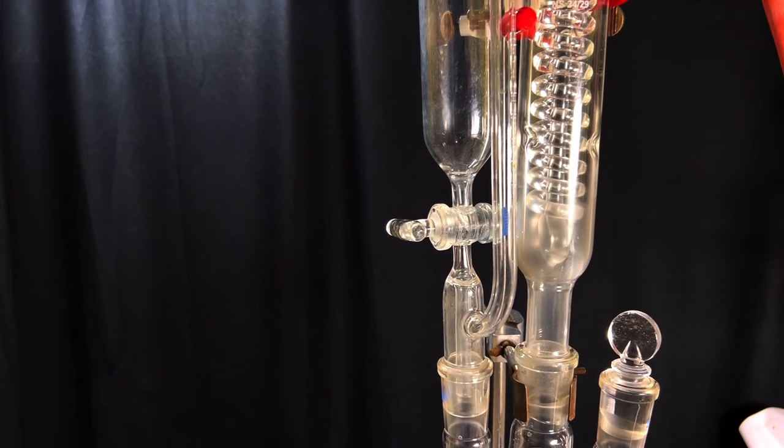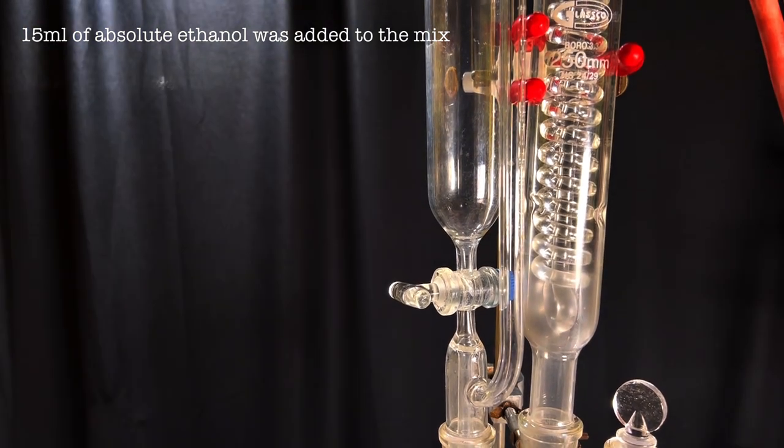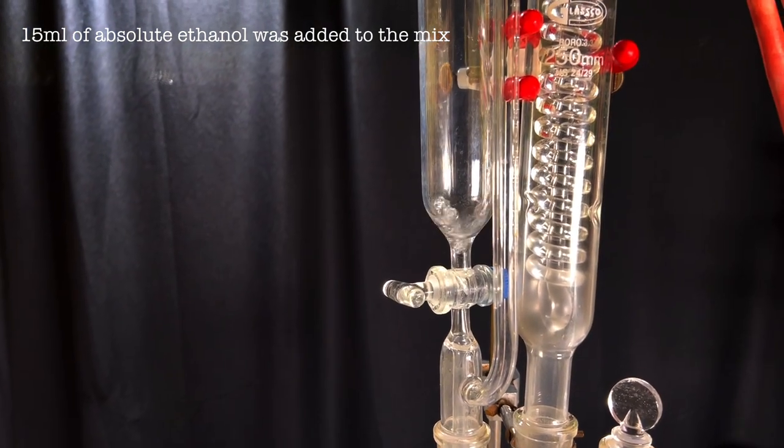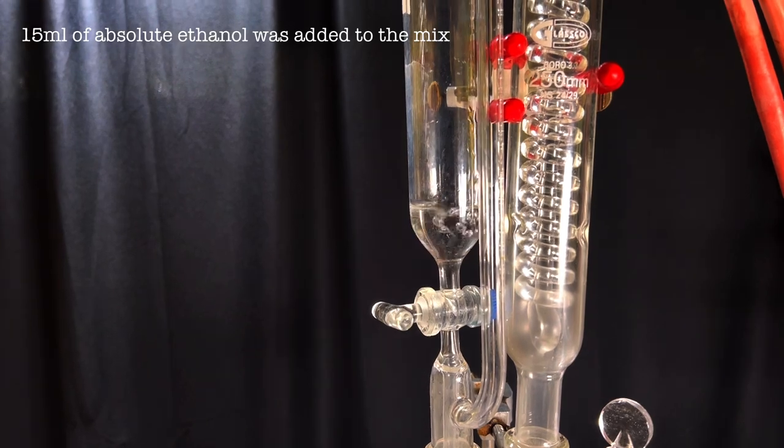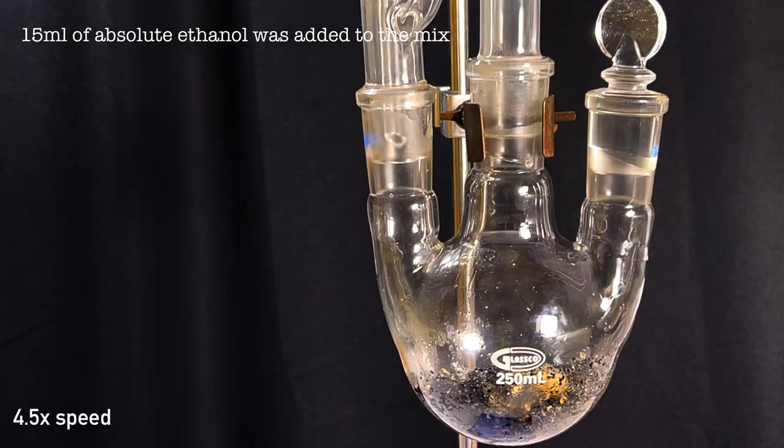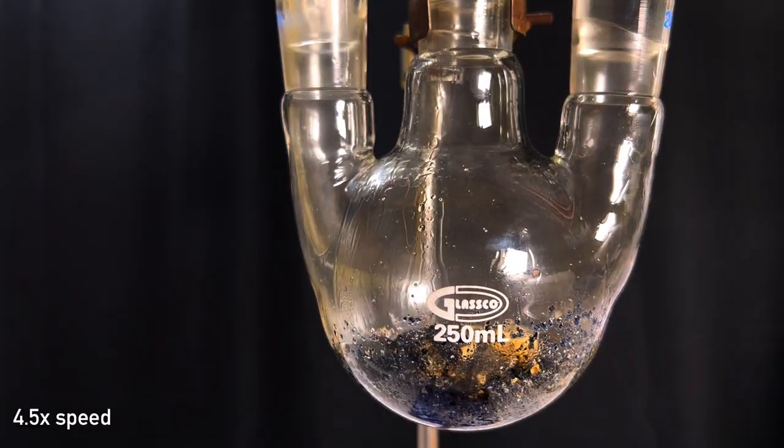Sodium metal can be removed by initially adding 15 ml of absolute ethanol through the addition funnel. Adding ethanol would cause sodium metal to react and heat up the reaction so much that the contents once again start to reflux.